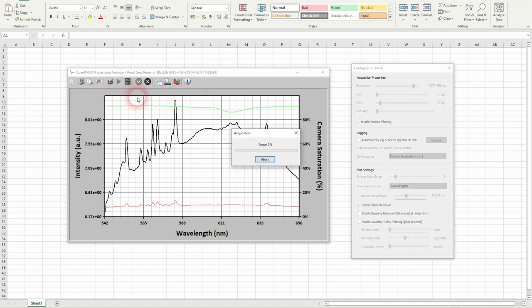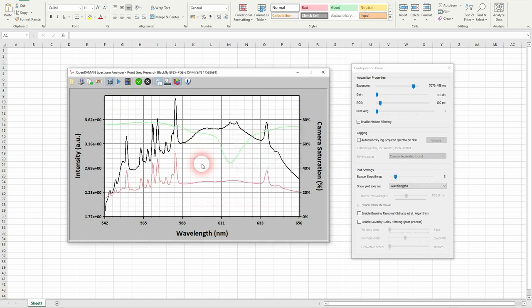And take a spectra again. And this is still a bit too low. So we'll increase this.